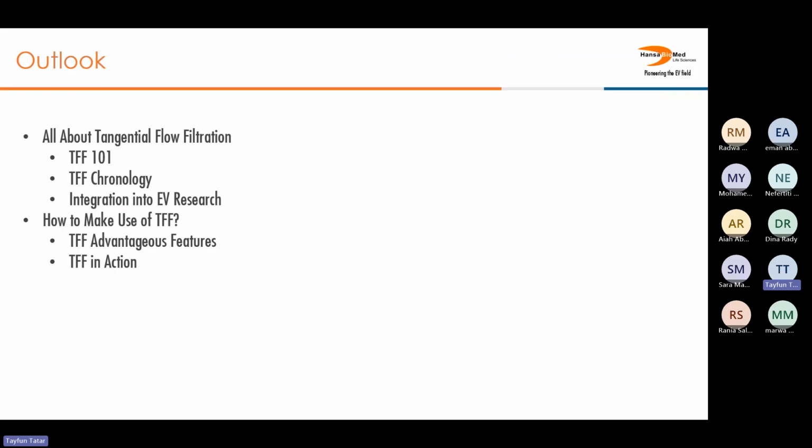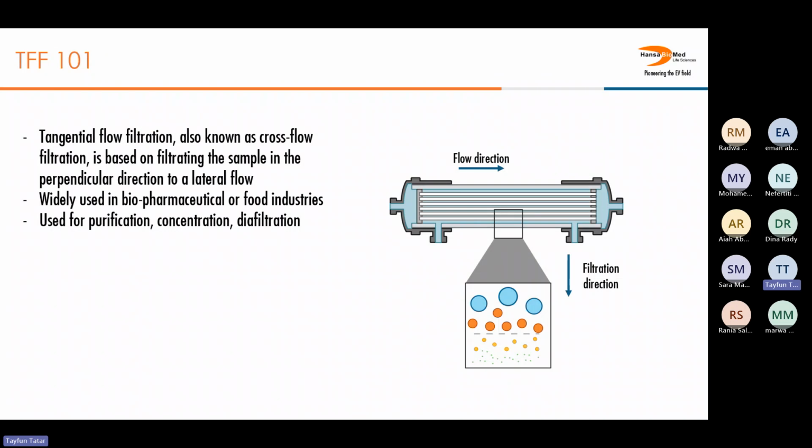And of course, after the presentation, you can feel free to ask any questions, also during the presentation. If you have any doubts, please feel free to interrupt whenever. So let's start with the basics of tangential flow filtration.